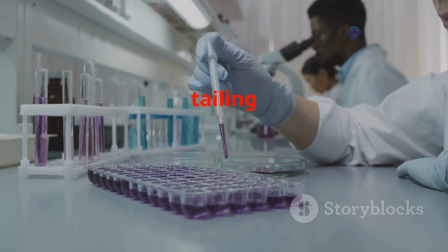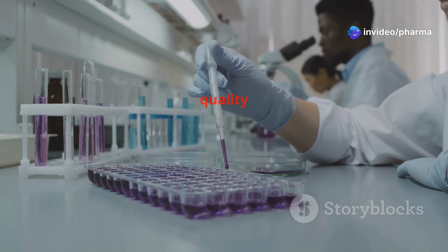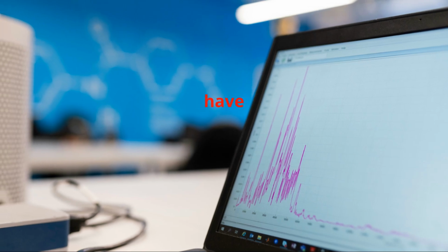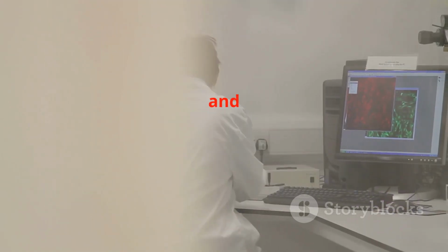In summary, the tailing factor in HPLC is an important metric used to evaluate the quality of chromatographic peaks and the performance of the HPLC system. An ideal peak should have a tailing factor close to 1, indicating good chromatographic performance and peak symmetry.